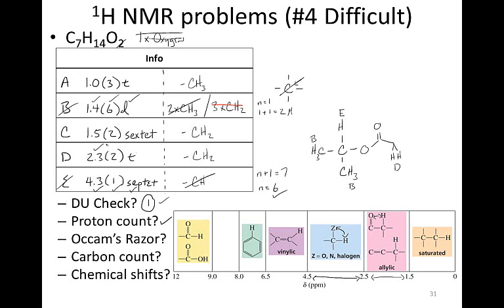Okay, so they have the right ppm shift, they have the right integration, and so then the only thing we have to take care of is the splitting pattern. If the protons D were a triplet, that would indicate that N plus 1 is 3, so that means N is equal to 2. That means that we have 2 vicinal protons to protons D. If that's the case, it's very simple to draw out. So we have 2 vicinal protons to protons D, and that would explain that triplet.